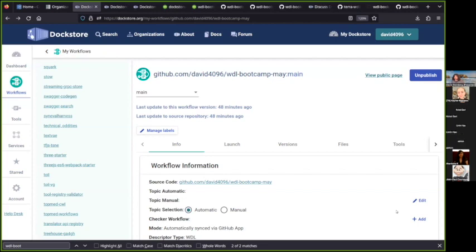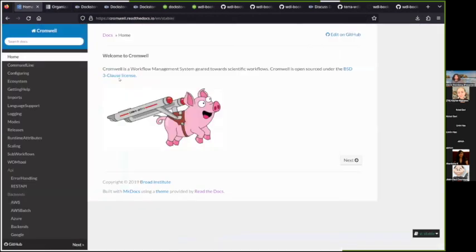Hi, I have a question regarding running Cromwell locally. The instruction said take small scale data, but data could be of many types. So is there a tool which works uniformly to take the slice and run it through Cromwell locally, or does it depend on the data and you do it separately?